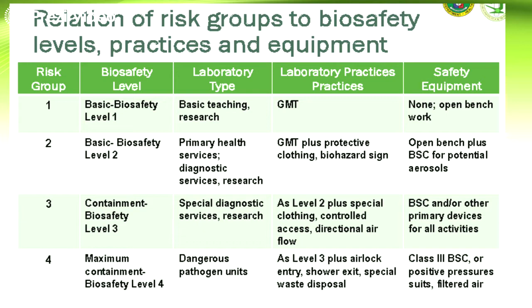Okay? Now, for the biosafety level 2 naman, ito yung mga meron tayo sa mga primary health services and diagnostic service and research center. Biosafety level 3, this is for the special diagnostic services and research. And for the biosafety level 4, this is for the dangerous pathogen unit. Ito na yung mga, ito yung nasa reference lab, which is the RITM.